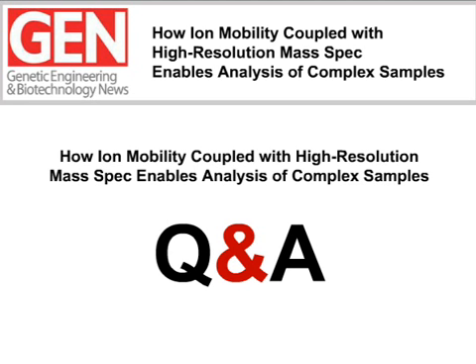That's a great question, and we've been doing some research in that area, and not just for bacterial toxins, but for things where the interference components are really, really high. The answer to that question is sometimes yes and sometimes no. It depends if the interference hurts your ionization. If you use electrospray ionization, and they suck all the ionization possibilities out, then it won't help.